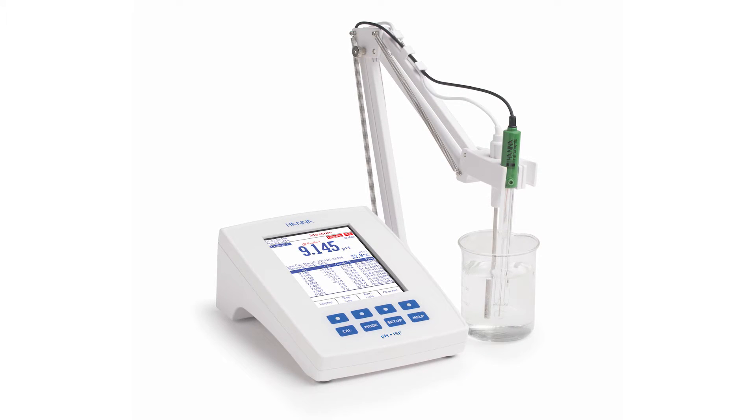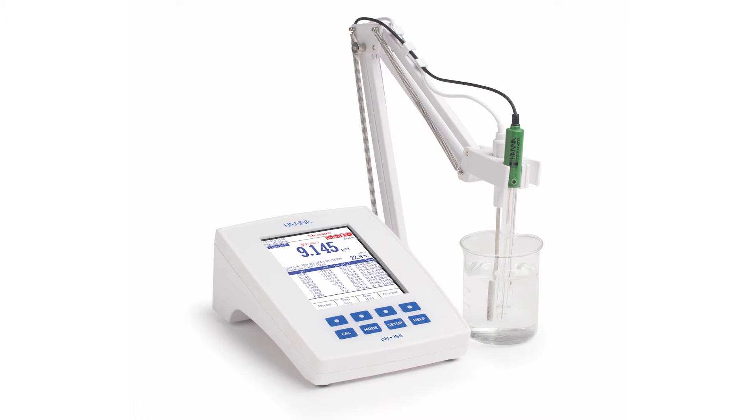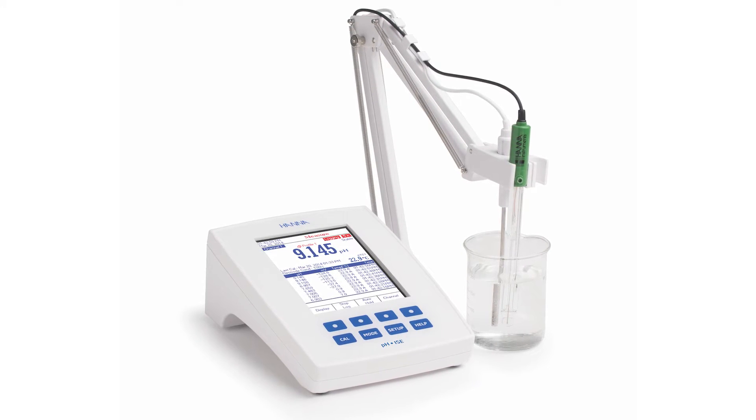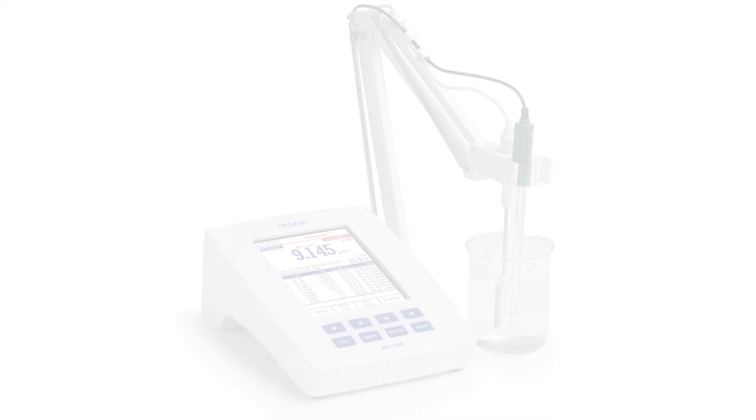Using the HANA HI5222 laboratory-grade benchtop meter takes the subjectivity out of determining the pH endpoint, making your manual titrations easier and more accurate.